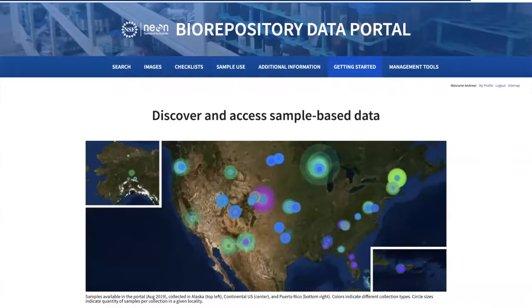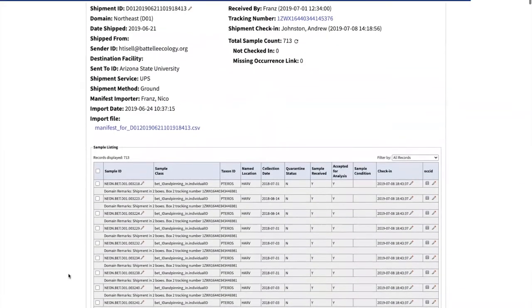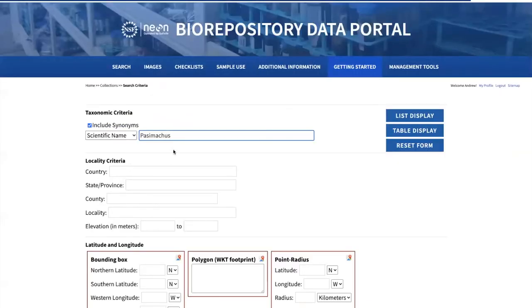All of our collections are tied together through the NEON Biorepository data portal. Through this online portal, we manage everything from shipments sent to us and received. We can search for all of the pinned beetles sent to us and open up these manifests. This is how we check in individual samples — such as this individual Pterostichus received from Domain 1. As we do this over time from all shipments, we get occurrence records within our portal.